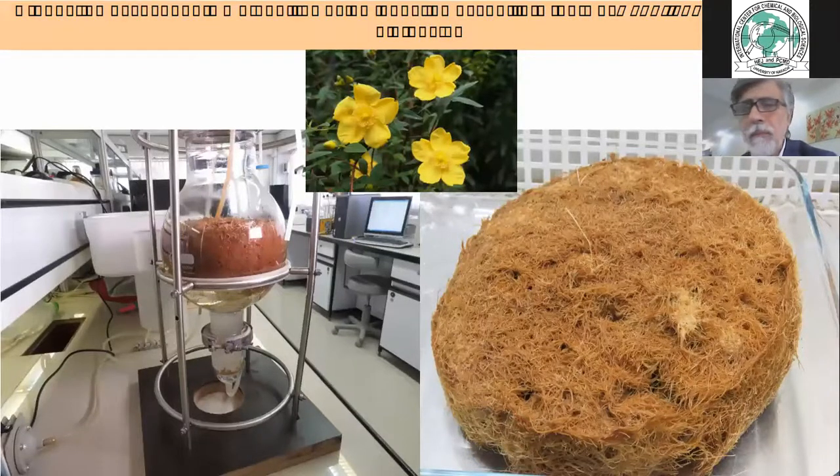This is a medicinal plant, and its hairy roots are valuable for extraction of the secondary metabolite used for PMP, plant-made pharmaceuticals. The bioreactor you see in here has been designed by ourselves, by our own. So these are not very difficult technologies. Everybody can do that, and we are really prepared to share the technology that we have. And then when taking out a few hairy roots, we can have tons of these hairy roots, and from them, we can extract what we need.